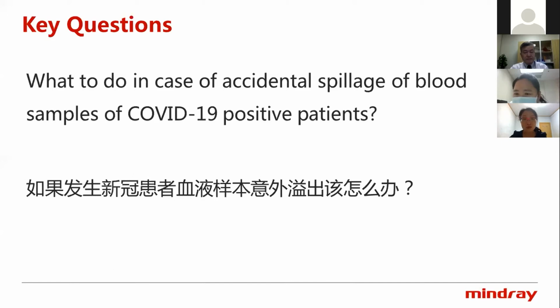This disinfectant should be prepared within 24 hours before usage.